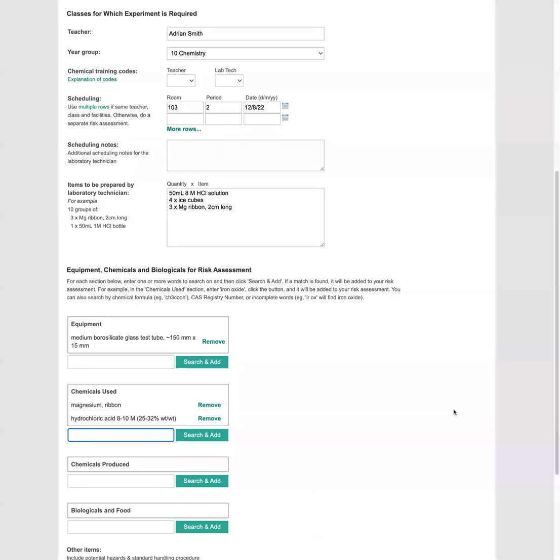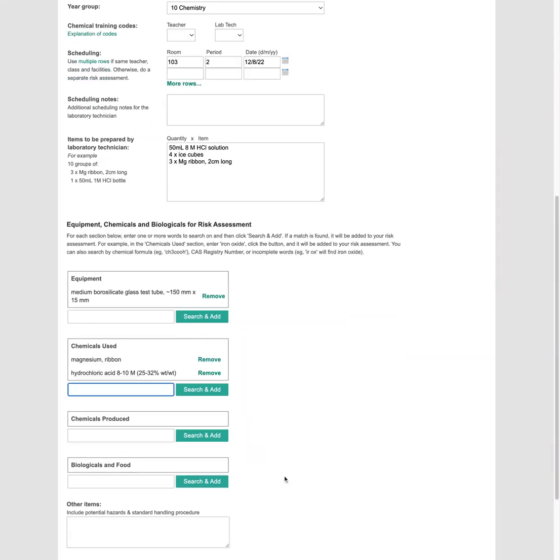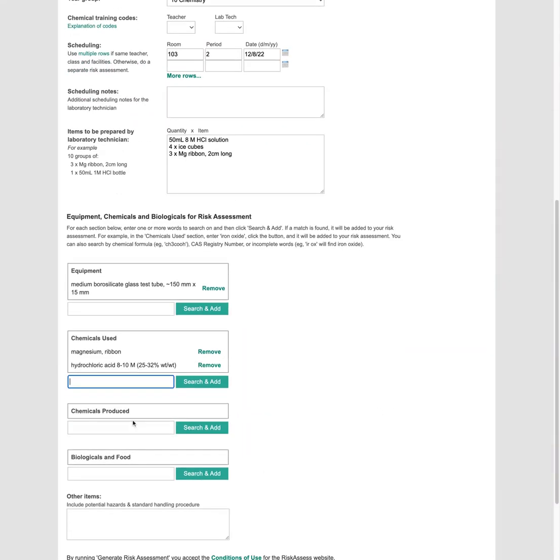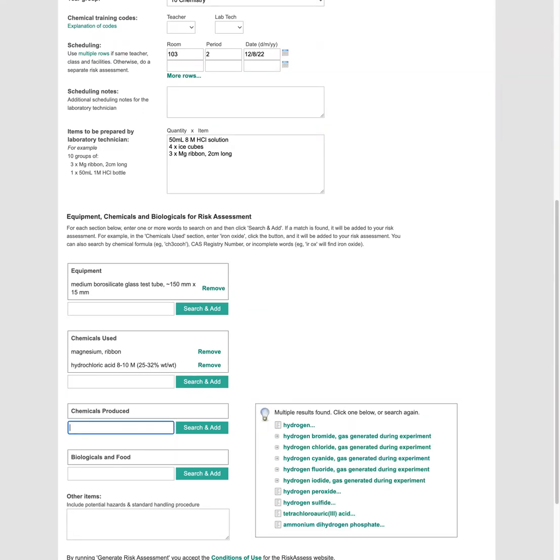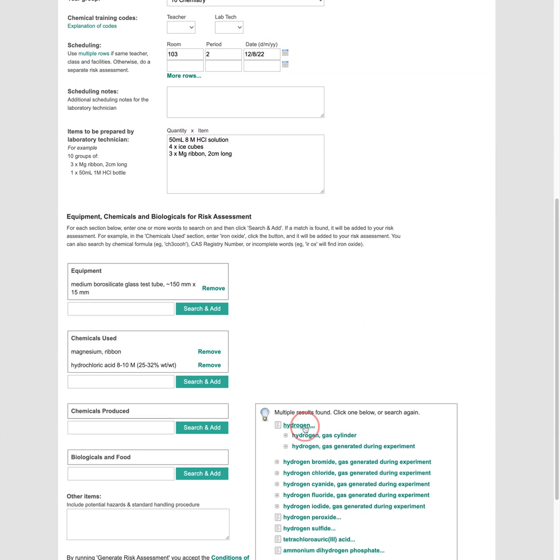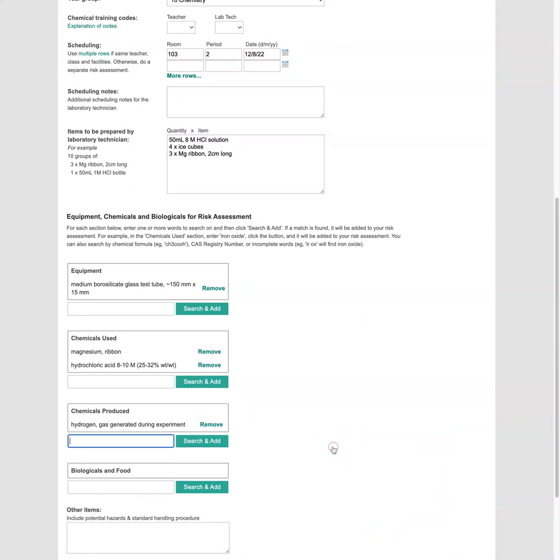Now it's also important to enter in the chemicals produced because a flammable gas or toxic chemical might be created during the experiment. So we're going to search on hydrogen gas. So search on hydrogen and let's have a look. Hydrogen gas generated during the experiment.